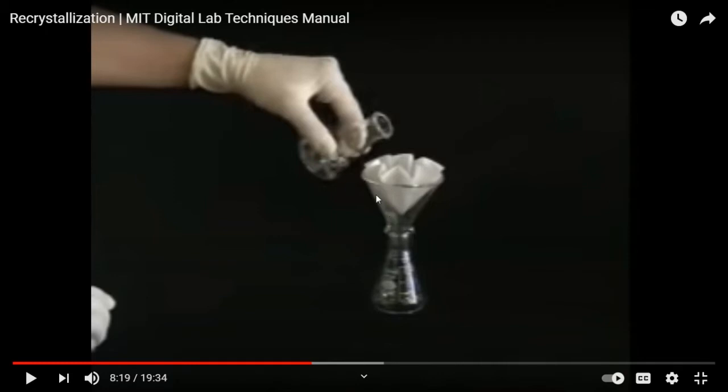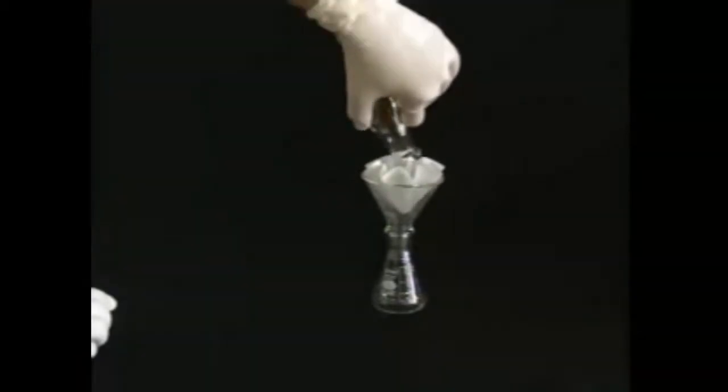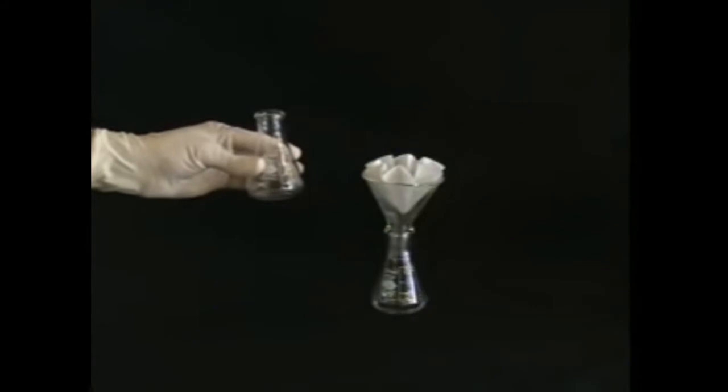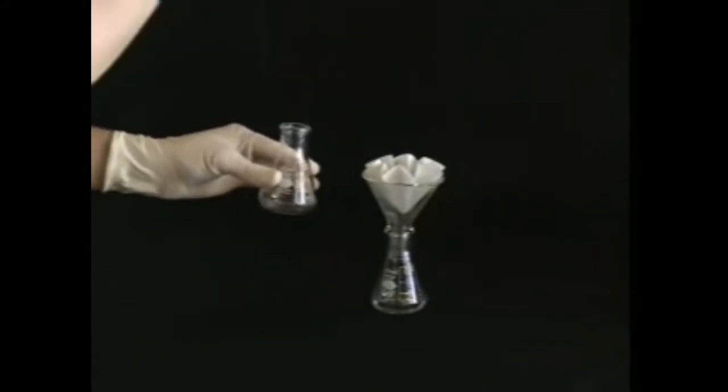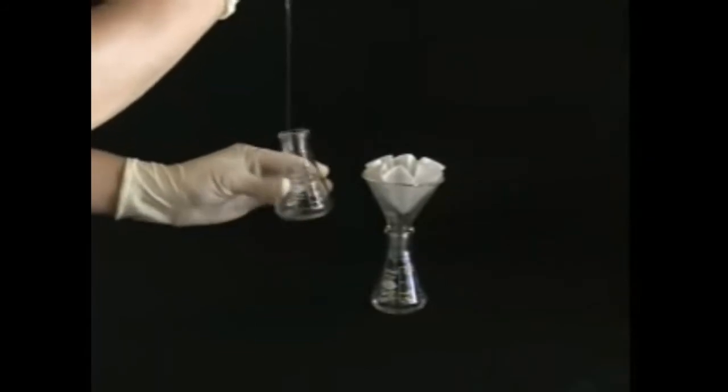Okay? Then no matter how long it takes for the liquid you pour over to drip, it doesn't matter. It is really hot. Hopefully you got that. I'm moving on. Rinse the flask 2 or 3 times with hot solvent, filtering each rinse.